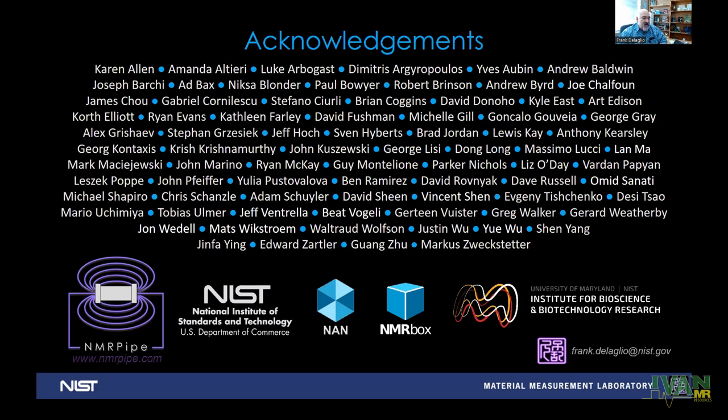Now, the software was initiated to support the work of multidimensional NMR in the structural biology laboratory, but over the course of years, it was also adapted for commercial purposes, such as ligand screening in a pharmaceutical company, vaccine quality control, and analysis of food and metabolomics mixtures. So we can see some examples of those different things today.